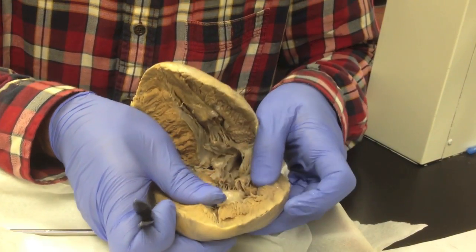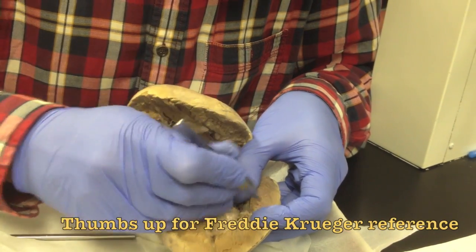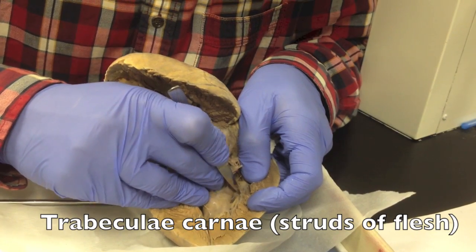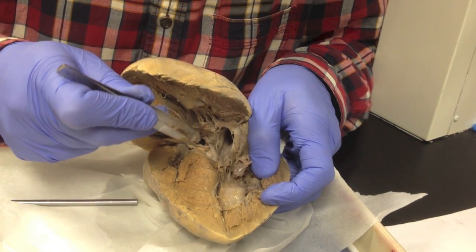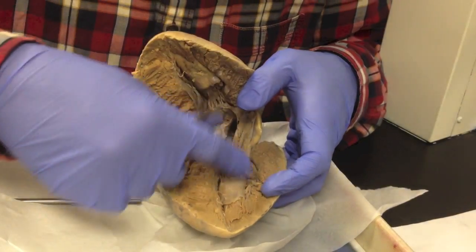If you stretch the walls of the heart, you see something that I tell my students looks like Freddy Krueger — and it does look like Freddy Krueger — which are the trabeculae carneae. The trabeculae carneae literally translates into struts of flesh. So that's it for the left ventricle.